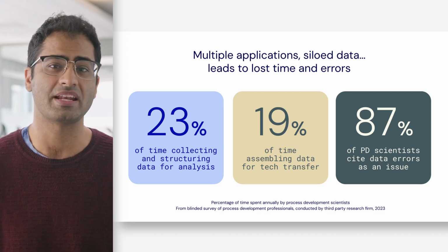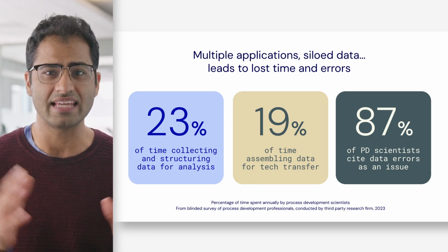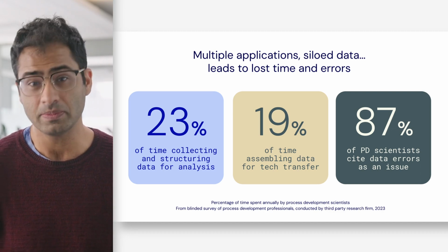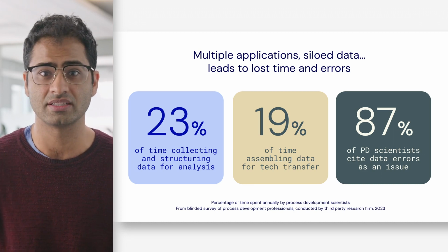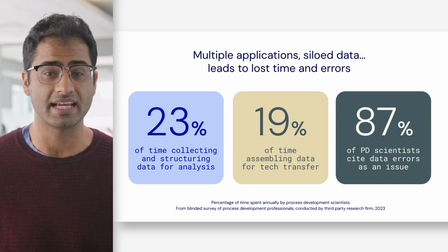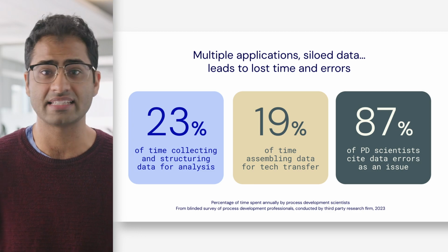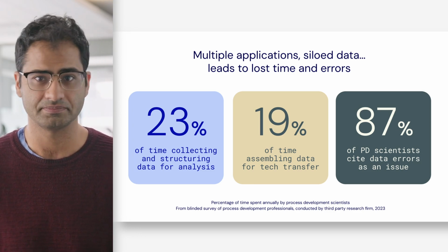We've designed Benchling Bioprocess to solve these challenges, bringing the end-to-end work from designing to execution to analysis in one platform. With Bioprocess, data can be automatically captured from instruments, and process parameters, online and offline data can all be seamlessly combined. Plus, it's built on ISA 88 data standards, which makes tech transfer significantly easier.